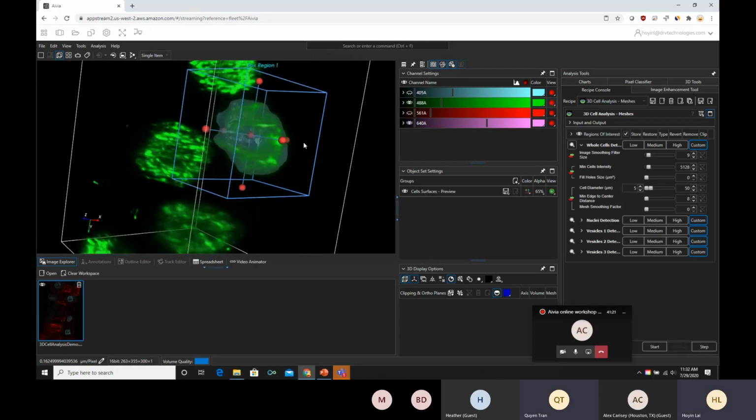Sorry, Julian, I'm going to just quickly interrupt you, because Alex is asking if you can quickly show the input and output sections of the recipe again.